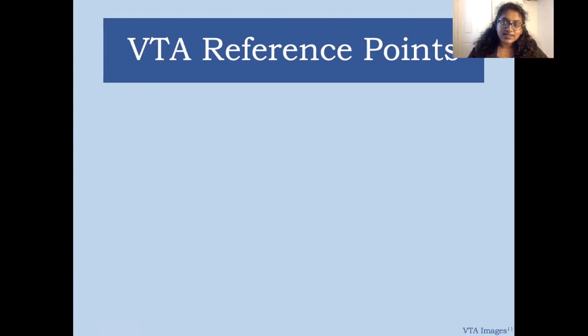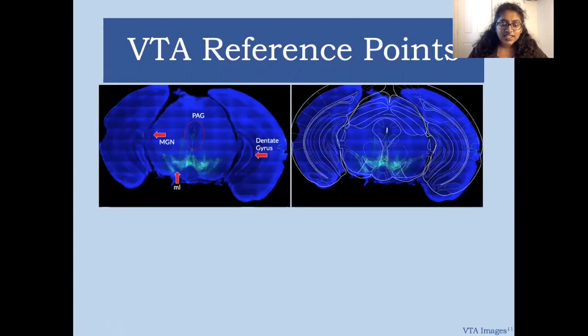When looking at VTA slices, a really useful tool to use is TH staining. TH staining stains any dopamine-producing cells, and this is especially useful for our purposes because it can help us delineate the VTA region, which is rich with these dopaminergic neurons.